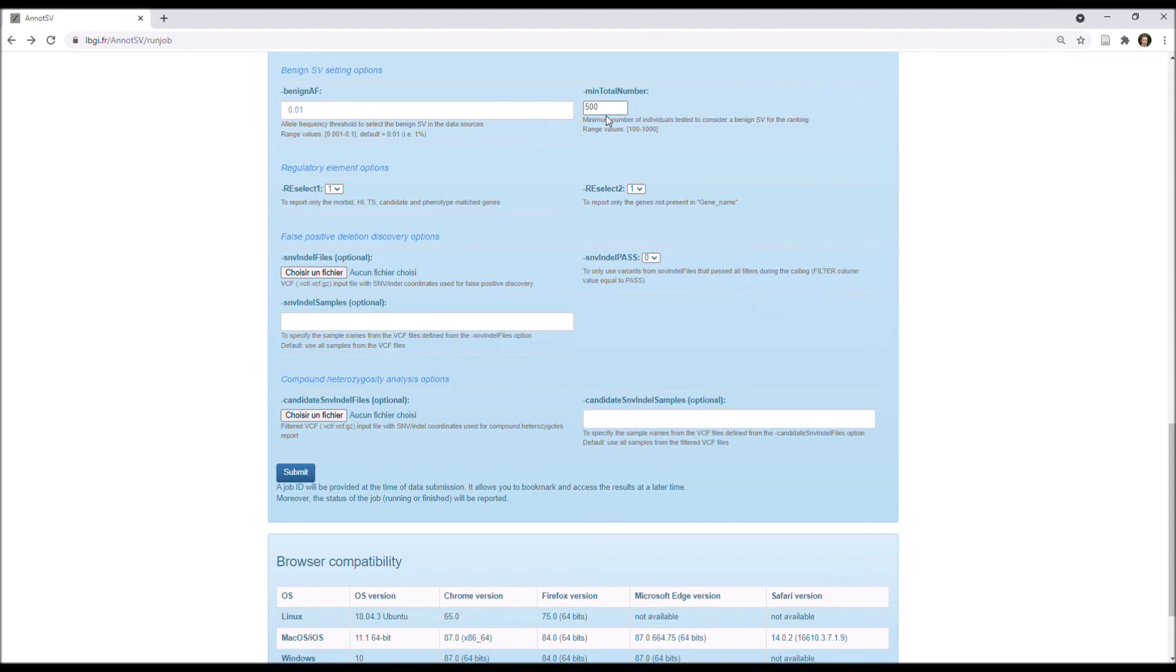Moreover, you can define there the minimum number of individuals tested to consider an SV as benign, but in my opinion, 500 is good. The allele frequencies will be relevant with this number.